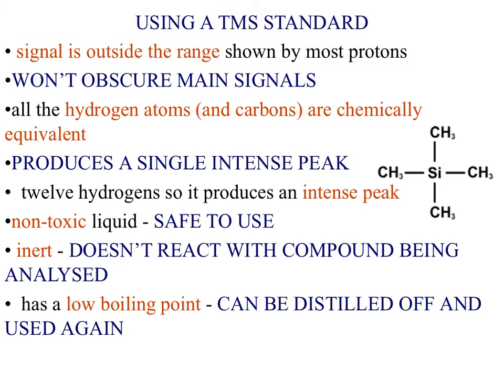It's non-toxic, that means it's safe. It is inert, it doesn't react with the compound that we are analysing, and it's got a low boiling point. That means that we can distill off this standard and we can use it again and again, therefore saving a wee bit of money. So we've dealt with the standard, and remember that that goes into the sample tube along with the sample.